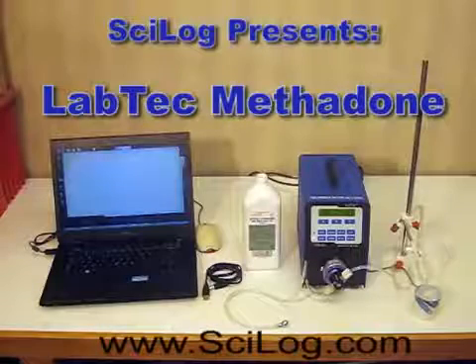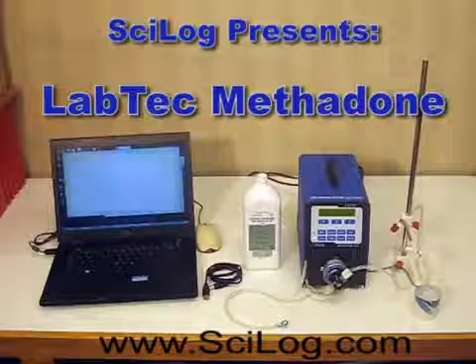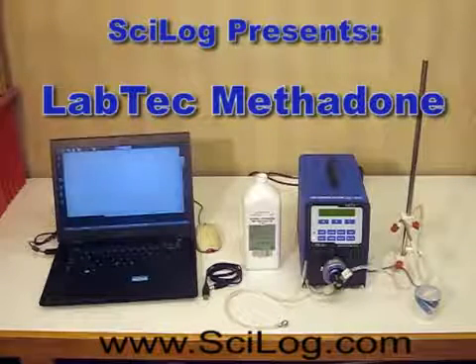Good morning. This is Douglas Johnson, Product Manager at SciLog Incorporated. Today I will demonstrate how to set up and use the LabTec Methadone system.